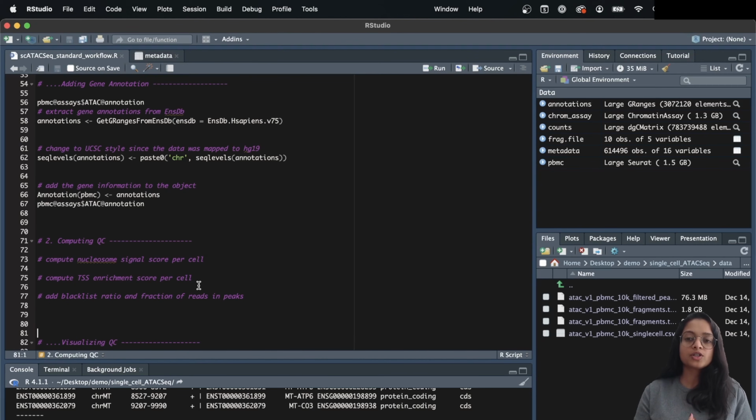It's important for us to understand what these quality metrics tell us about the data, and it's important that we have a good theoretical understanding of these metrics before we jump into demonstrating and performing it practically. So let us go back to the presentation to understand what they mean, and we'll come back and continue the demonstration once we've understood the quality control metrics that we will be taking a look at.